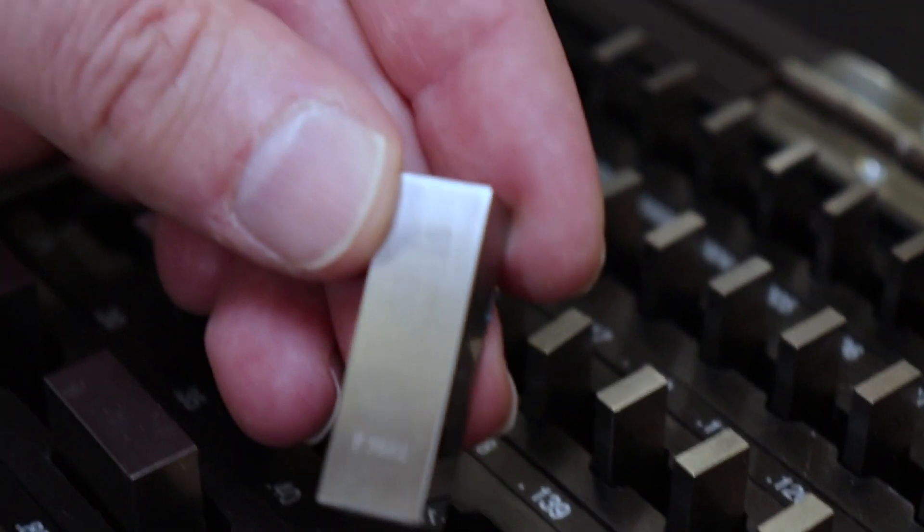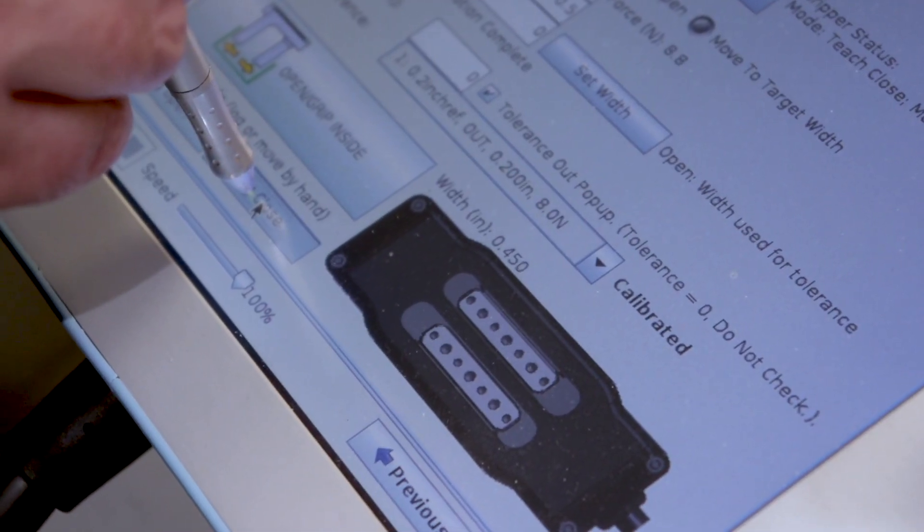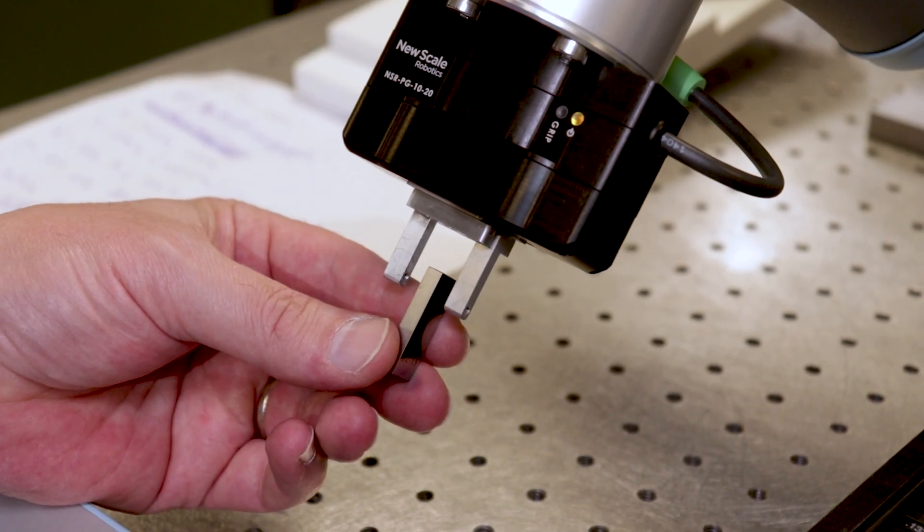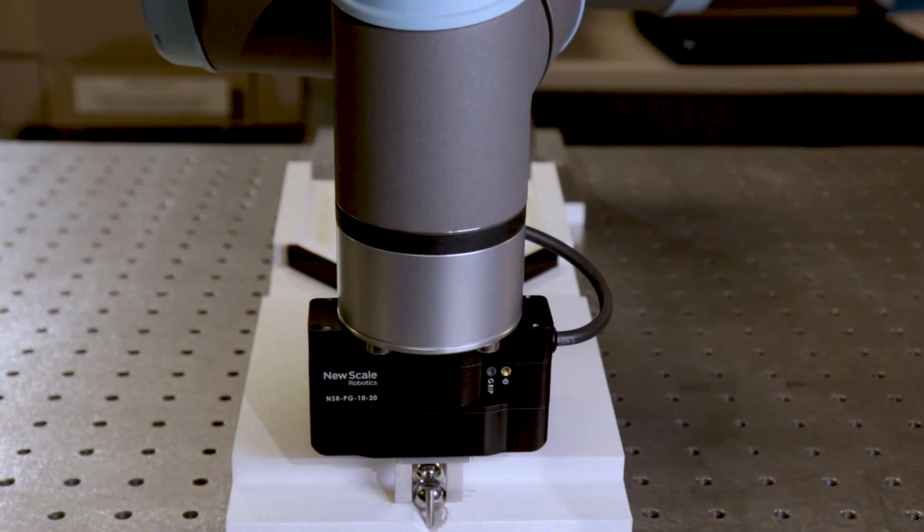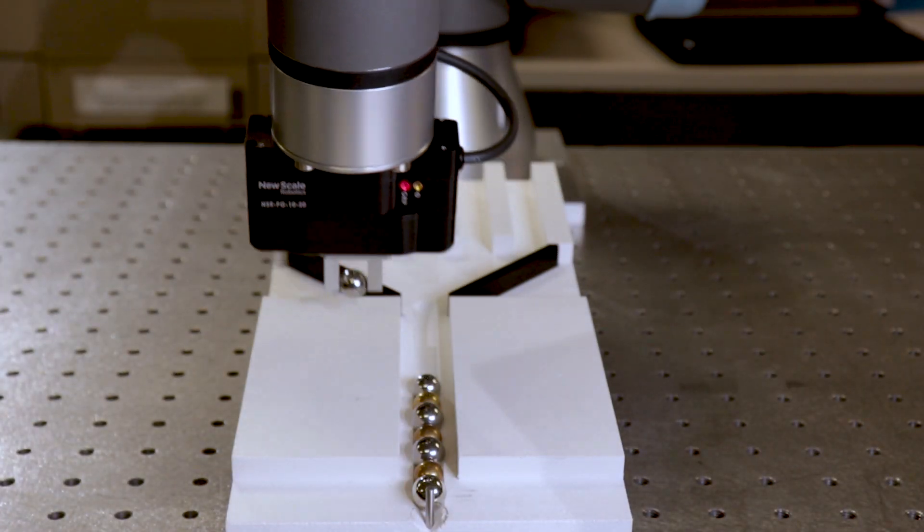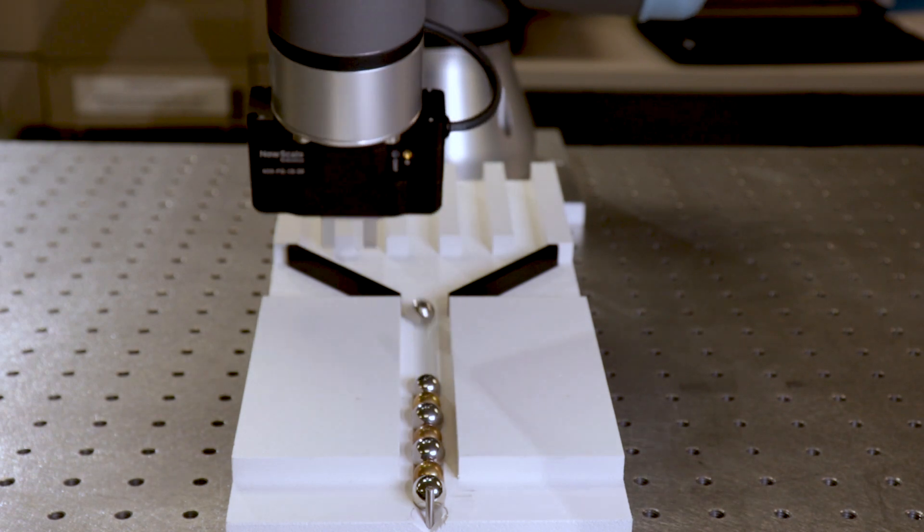Sporting an internal position sensor with a resolution of 10 micrometers, the gripper can tell which object it has picked up based on size alone. This allows the gripper to treat different objects in different ways, perhaps placing them in different locations.